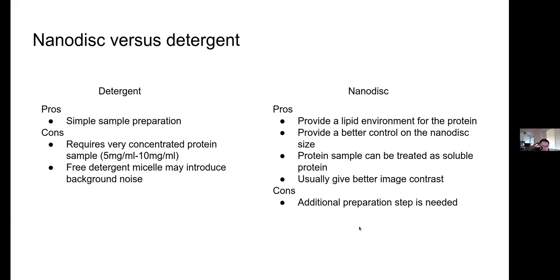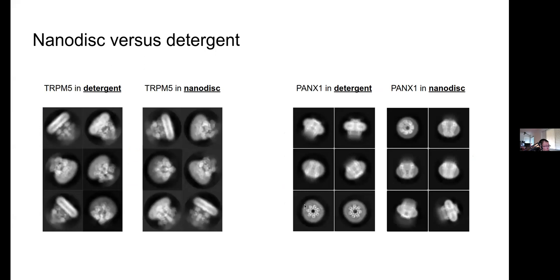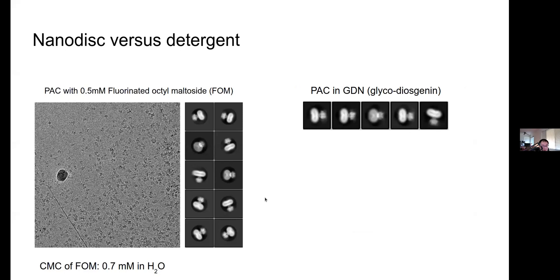Comparing TRPM5 and Pannexin-1 in detergent and nanodiscs, I obtained sub-4 Ångström structures in both cases with no observable differences between conditions. Because nanodisc sample preparation takes additional effort and resources, I decided to primarily focus on studying these two proteins in detergent. However, for PAC protein, the nanodisc sample offers better 2D and 3D reconstruction. In GDN detergent, the micelle is very large and allows large flexibility of the PAC protein, and I'm not able to see transmembrane helices in the 3D reconstruction in GDN. Therefore, I primarily used nanodiscs to solve the structure of PAC.